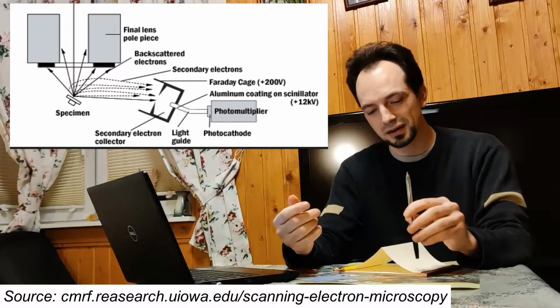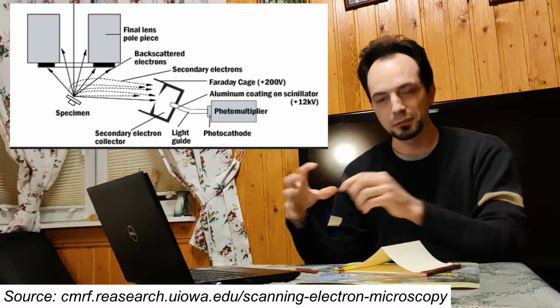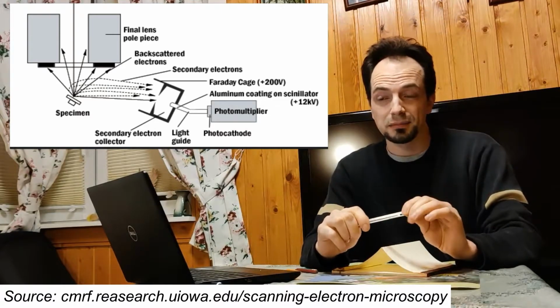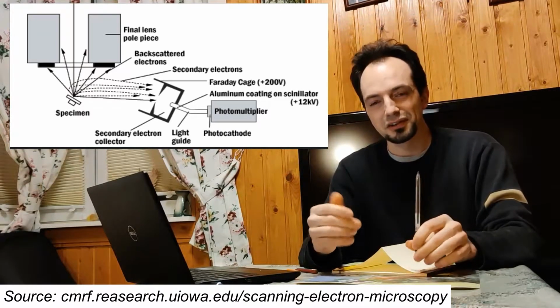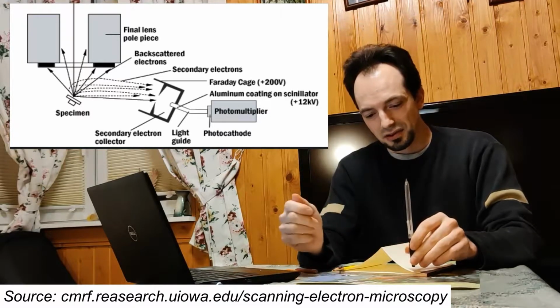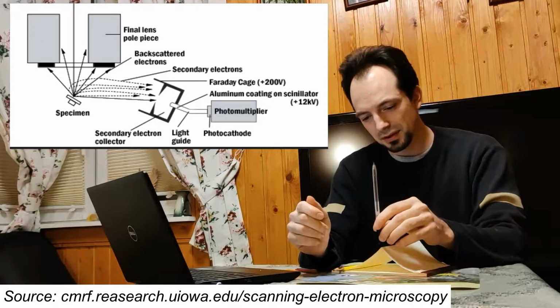So let's say the starting point is the top left corner of the sample. We are obtaining quite a low signal there, and we are coloring the pixel on the image respectively in any kind of palette, but usually a grayscale palette is used in secondary electron microscopy. So if the signal is low, we color the pixel black. The situation is almost the same as we go up this ridge.